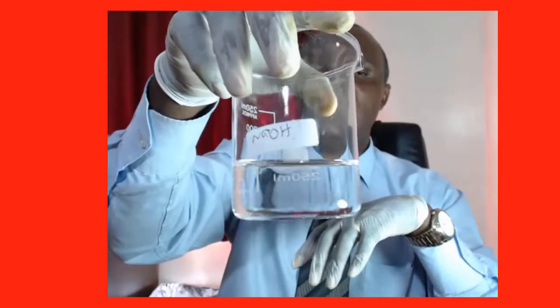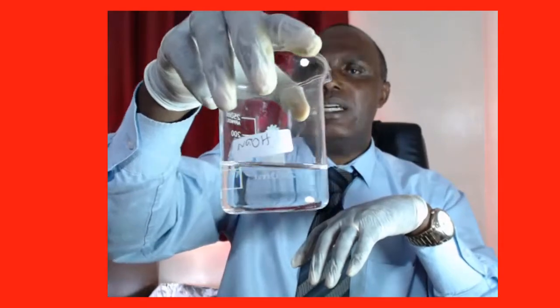We are going to look for its concentration, and we already know the concentration of the other solution. So that is the objective of this practical. Remember, oxalic acid, its RFM is 126, and the formula is H2C2O4. It has got 2 water of crystallization.